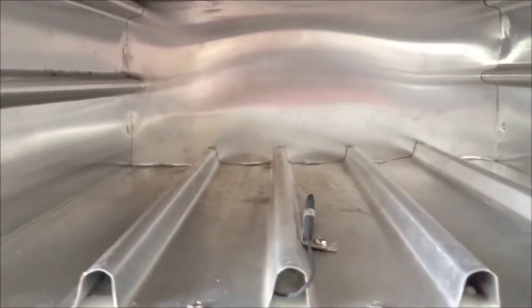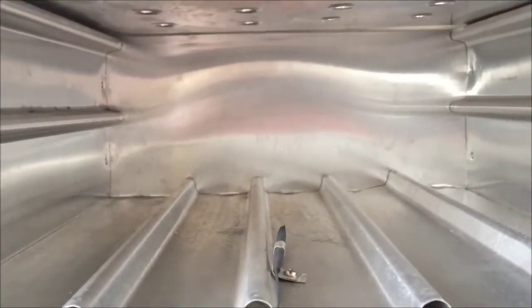These small vents or holes are used to remove vapor formed during the process of sterilization. On the surface of the tray there are many holes called perforations, which are meant for the circulation of hot air throughout the oven.